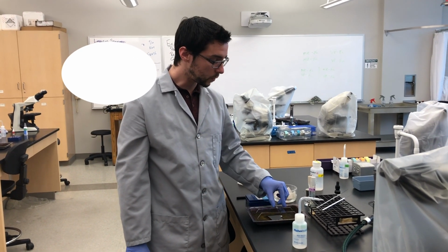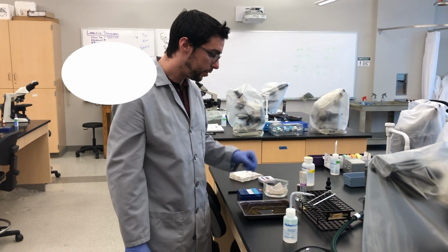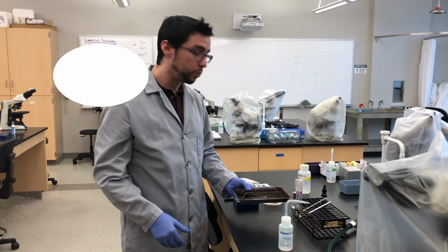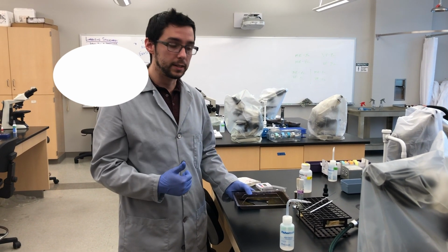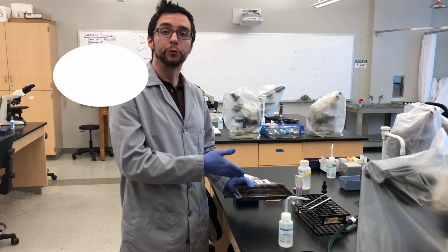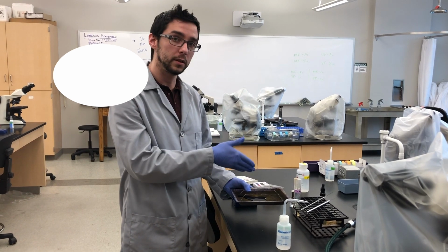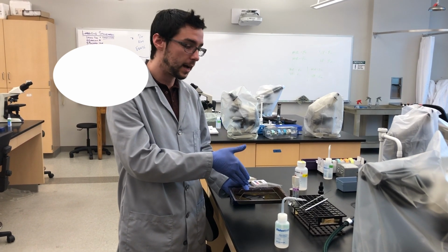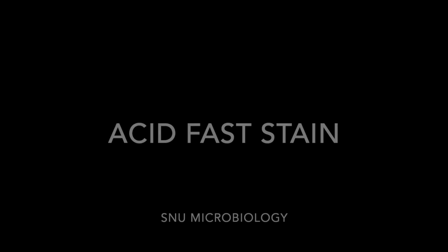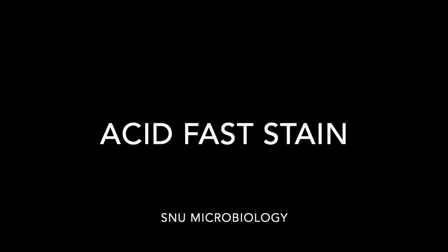Now, once you have your slide stained, great. How are you going to get rid of these? These stains that we use with both endospore and with acid-fast stains, they are very environmentally unfriendly. And so what we're going to do is we're going to have you keep the wash-off in your dye trays, and the TAs will come around and collect that for us to dispose of all together at once. So do not pour these down the sink.